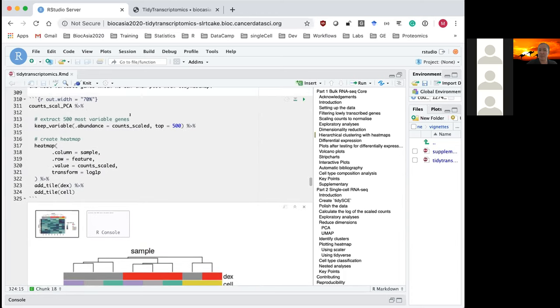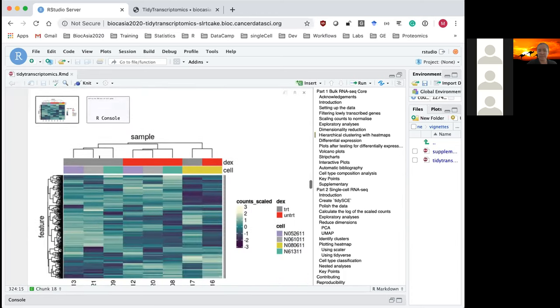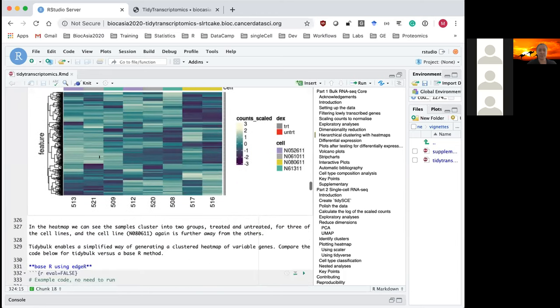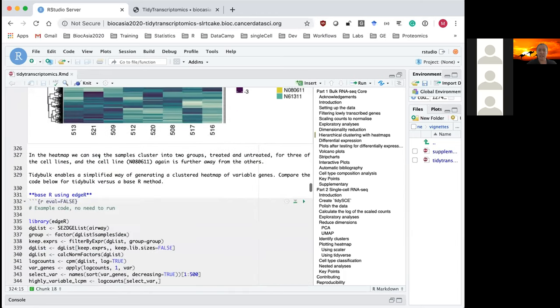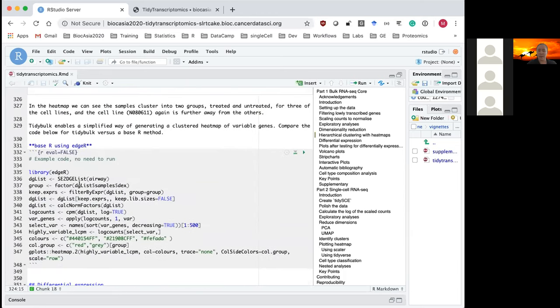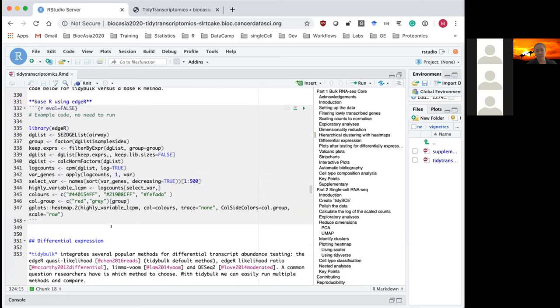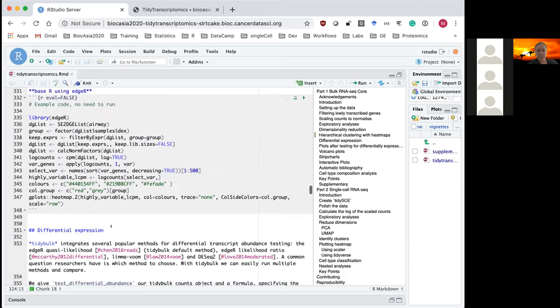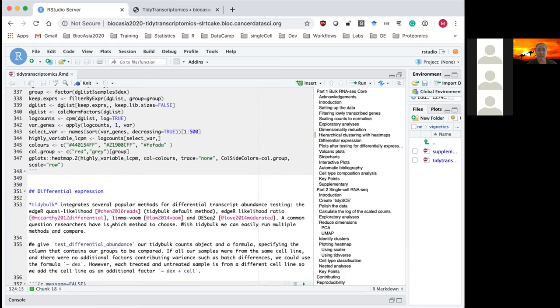As you can see, with a few lines of code compared to a base R approach using edgeR, we have to create far more variables and use functions that can be harder to understand for people not familiar with RNA sequencing statistical jargon.